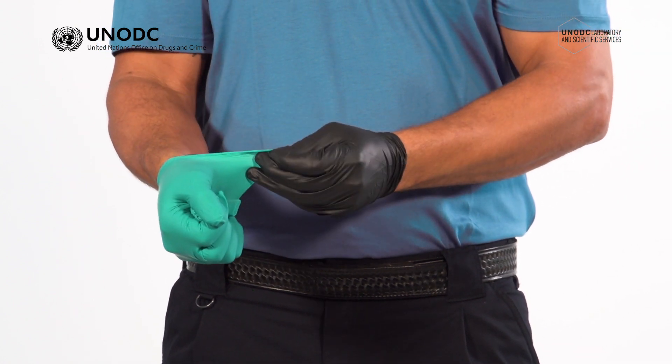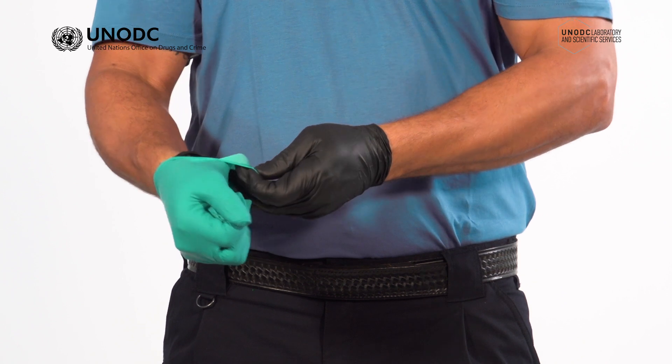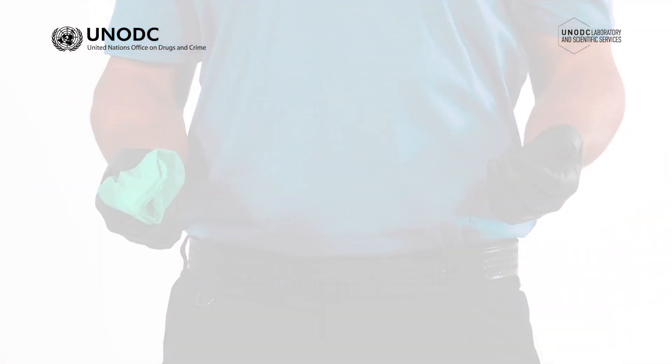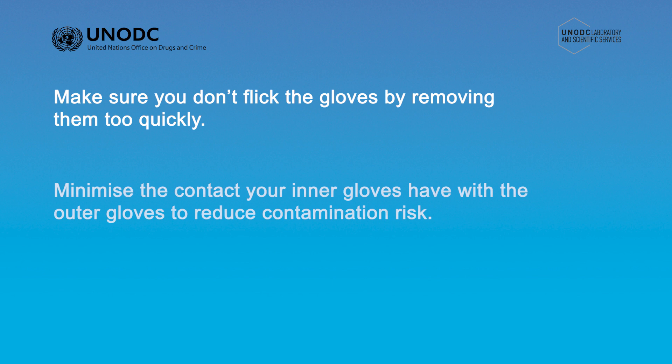Instead, pinch and hold the outside of the second outer glove at the top of the palm just below the cuff and pull it away from the wrist. Curl your fingers under the outside of the glove and pull the glove down, keeping the first outer glove bunched securely in your palm. As the gloves come away from the hands, make sure you don't flick the gloves by removing them too quickly. Minimize the contact your inner gloves have with the outer gloves to reduce contamination risk.